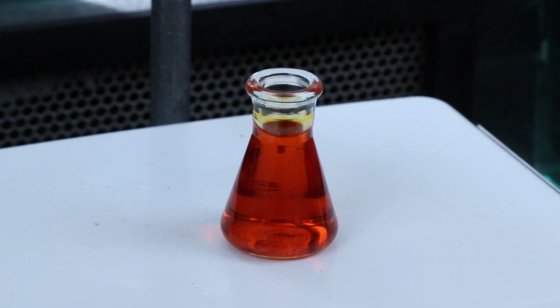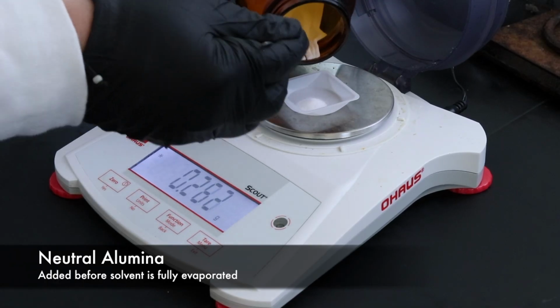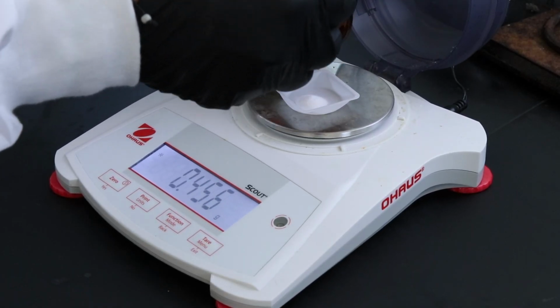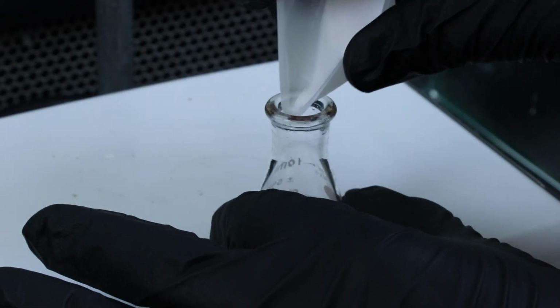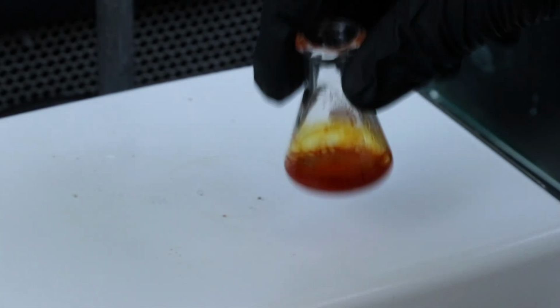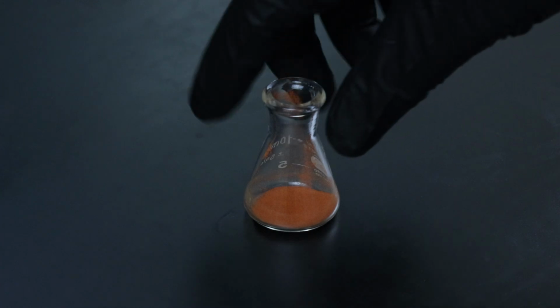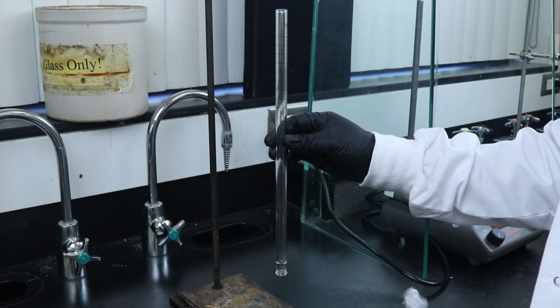of the Erlenmeyer flask, and then I'll be adding 500 milligrams of the neutral alumina, which is the same stuff that we'll be adding to the column to separate the compounds. This helps make the evaporated products more of a sand-like solid, which is easier to handle and transfer, so it'll end up looking like this, and now it's ready to be transferred to the column. So I'll start setting that up.